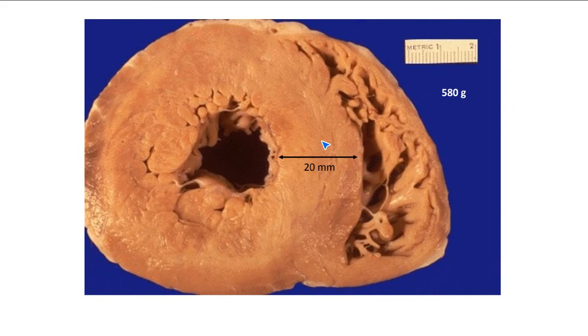Okay, so we're seeing ventricles. So I see, so we're seeing both of them. So which one is this one? Which ventricle is it? Well, left, and then clearly therefore this one must be the right ventricle. Okay, so we have gotten some measurements here.